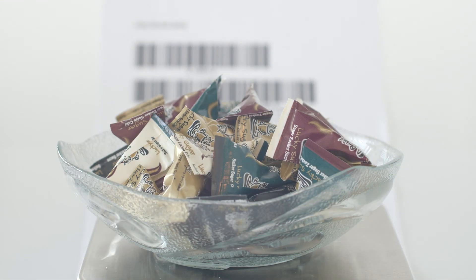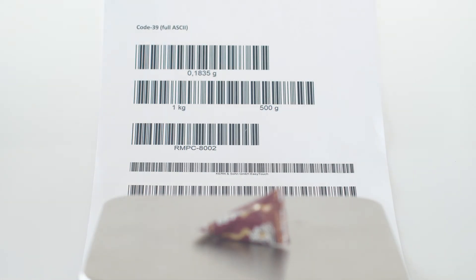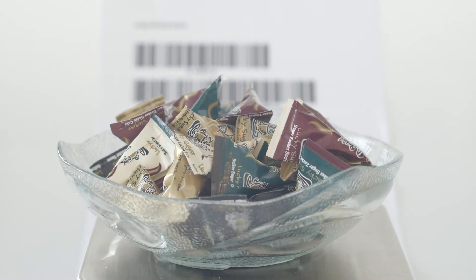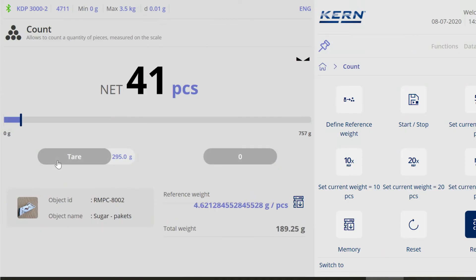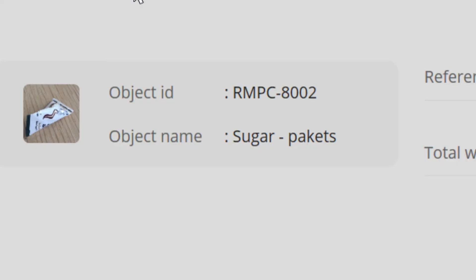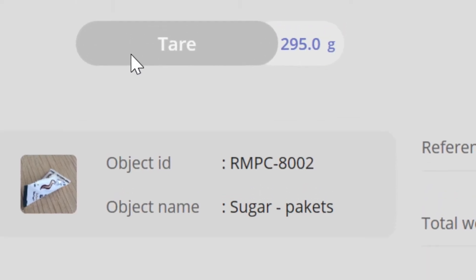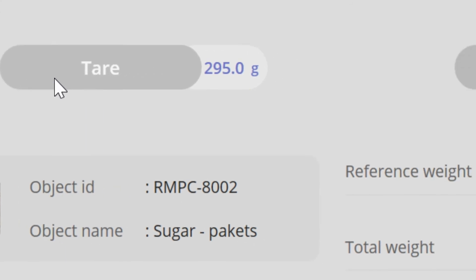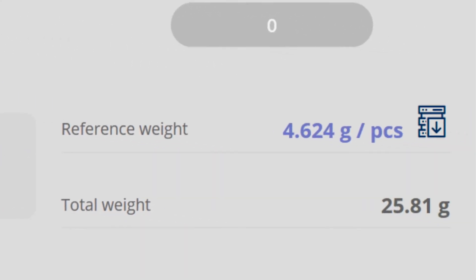Fill container with parts, call up object, set up and read counting result, and done. Counting can be done that fast. This is possible with stored counting objects, with a stored pre-tare value and reference weight of the counting part.